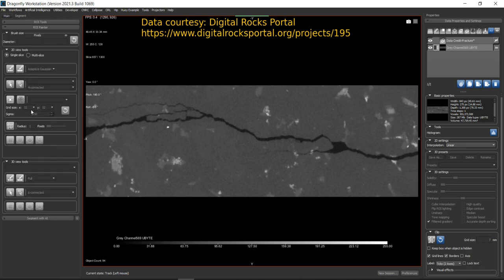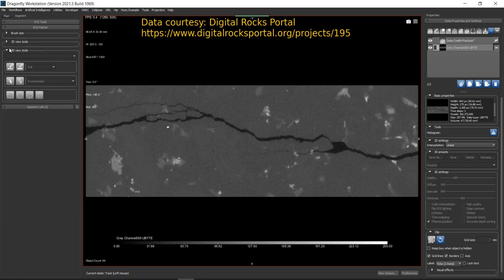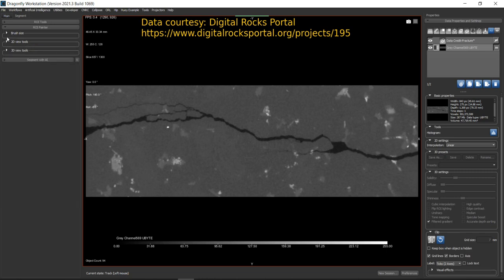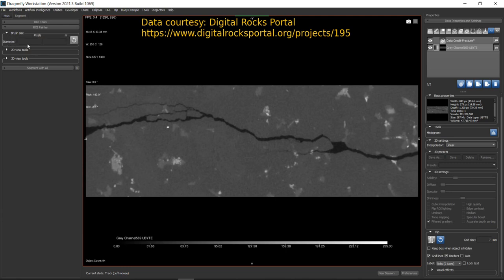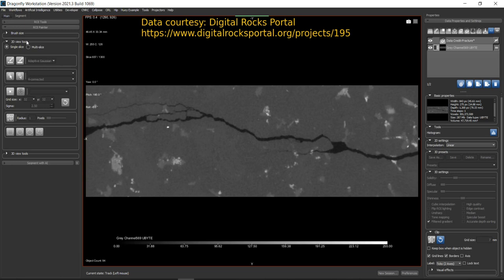Expand the ROI Painter if it's not already expanded. Under ROI Painter you will see three different groups. I'll shrink everything to make it clear: Brush Size, 2D View Tools, and 3D View Tools. The Brush Size group shows the size of the brush you choose in terms of diameter — in pixels and in meters — based on your preferences.